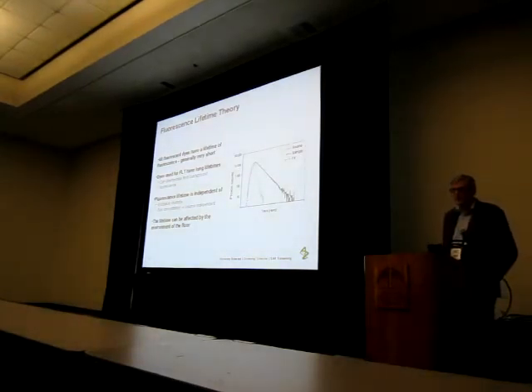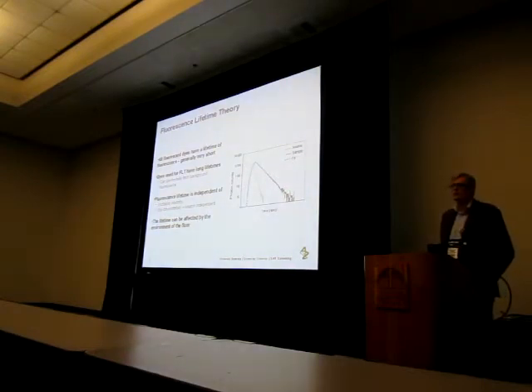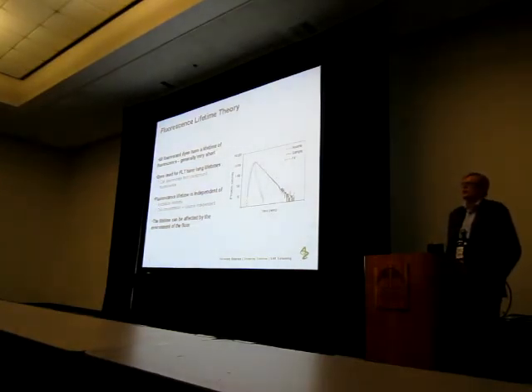Because it's independent of the excitation intensity and the system isn't dependent on the dye concentration, it makes it kind of volume independent. So it's relatively easy to scale from 384, 96, 1536. All of that stuff works really nicely here. Everything scales down really well. You don't have to worry about titering or retitrating an antibody or a bead concentration.